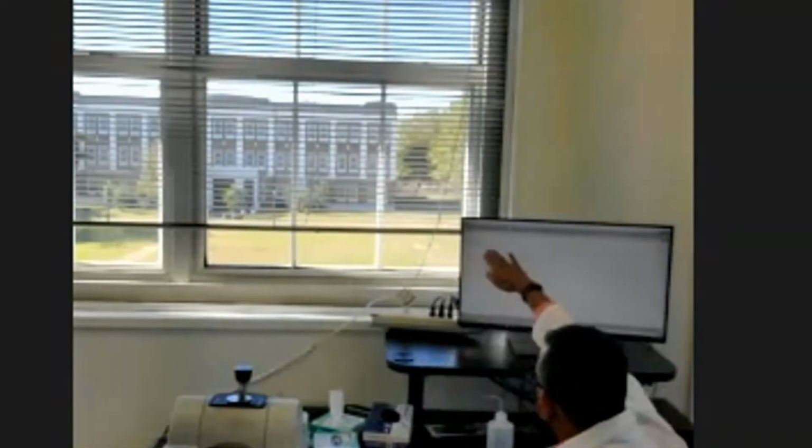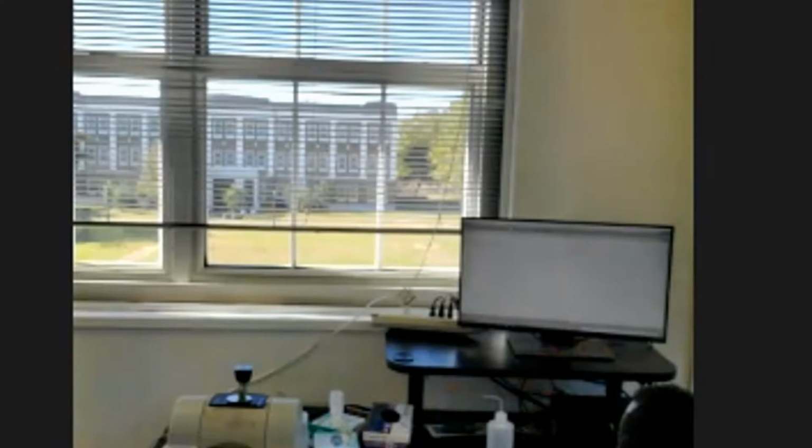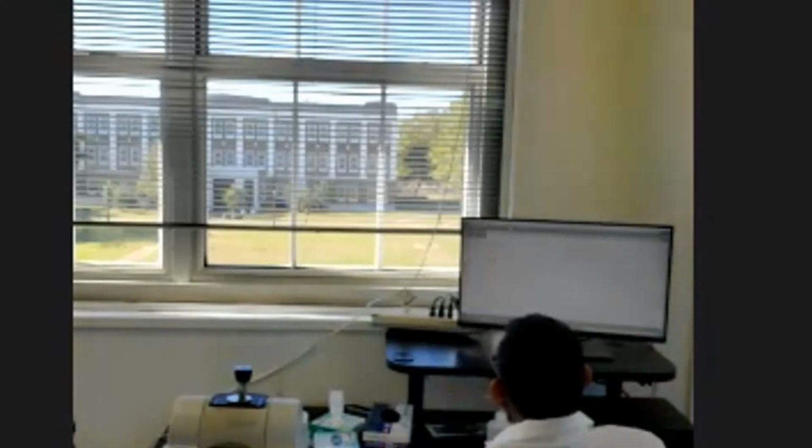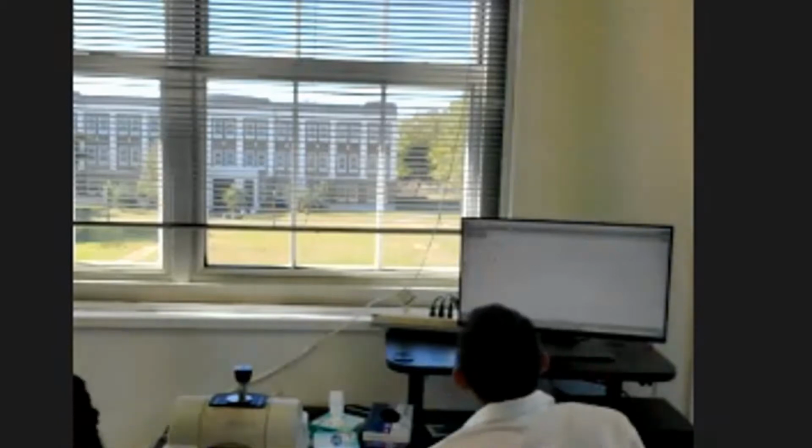Okay. So you can see clearly the differences, right? One was, from the first scan, a straight baseline. Here you see all of this going up and down. It means, as you said, it has impurities in it. So that's going to be a good point in order to compare sample number 2 and sample number 1. The baseline is not as flat as the first one is. It doesn't mean it has salicylic acid, that's what he says.